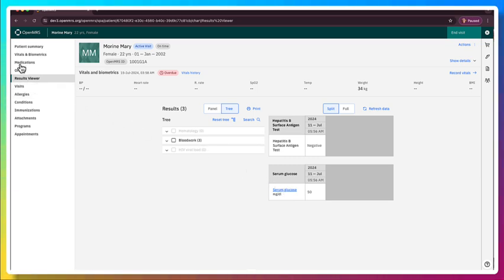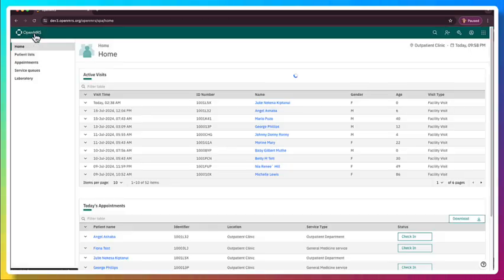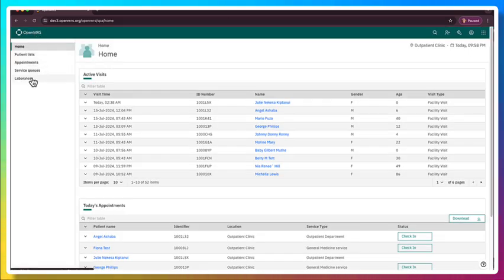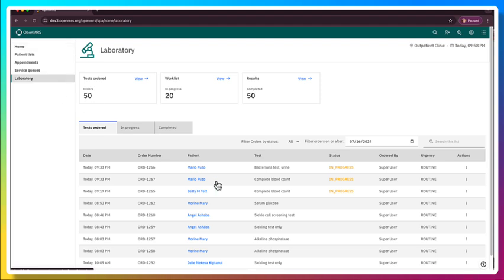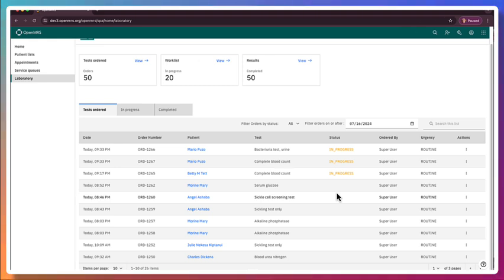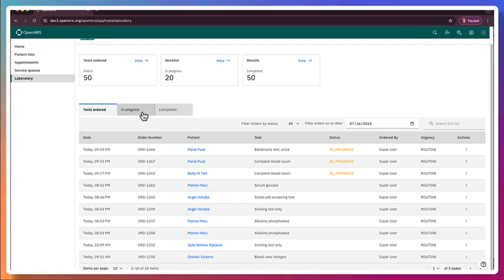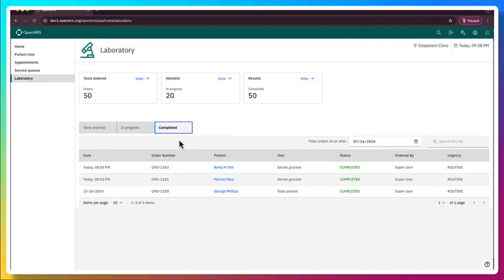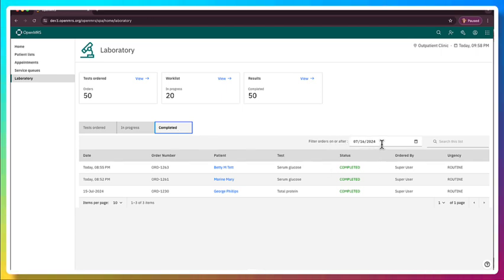So that is a very quick overview. You might have noticed that for smaller labs or for labs that don't have access to a laboratory information system, this will allow lab users to see what tests have been ordered, which ones are in progress, so when they've received the sample, and then be able to look at completed and filter to see completed by on or after which day.